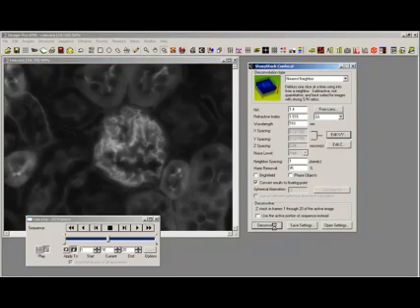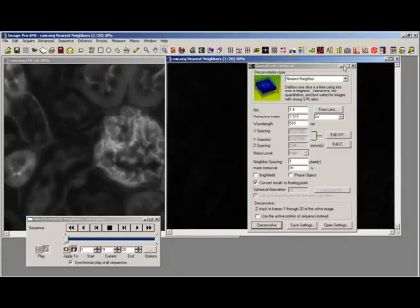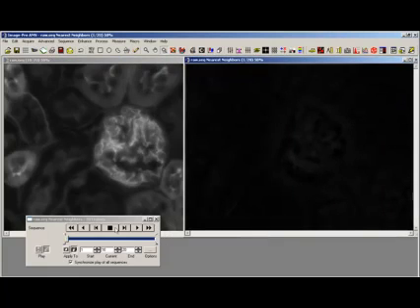Now, this algorithm, while this is running, is basically a deblurring algorithm. So it's not actually refocusing the light from where it came from, it's actually just ripping haze information out. And that's done now. And because you're ripping haze information out, your actual image that you're going to end up with tends to be closer to the noise floor than it is before.